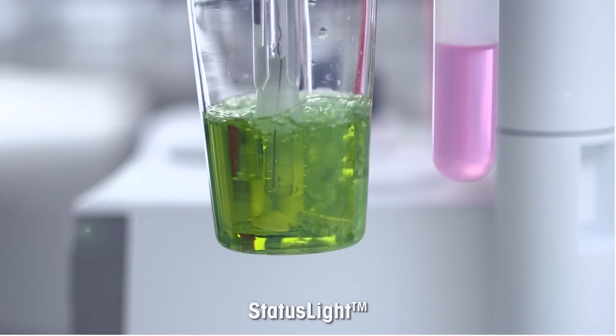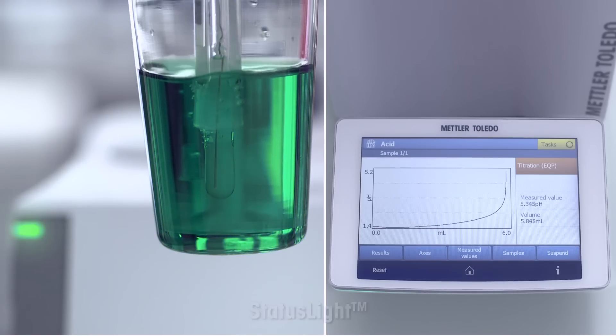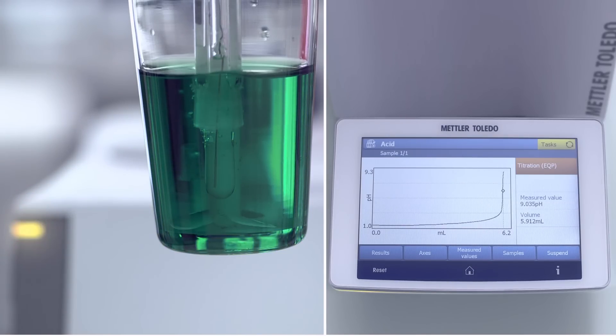Status light helps to increase efficiency by visual signaling. The operator can stay in touch with the titrator from anywhere in the lab.